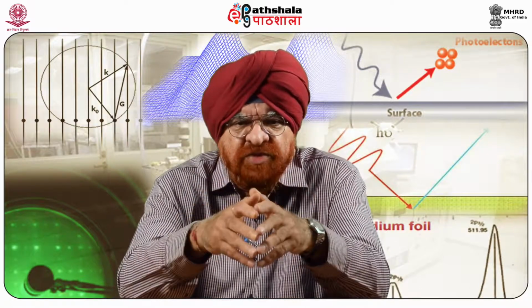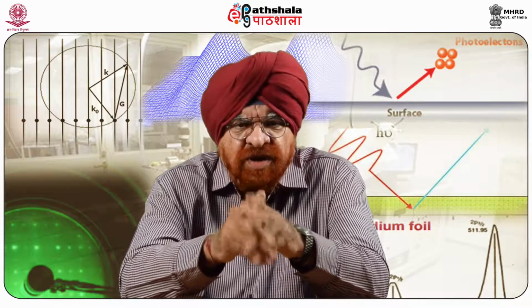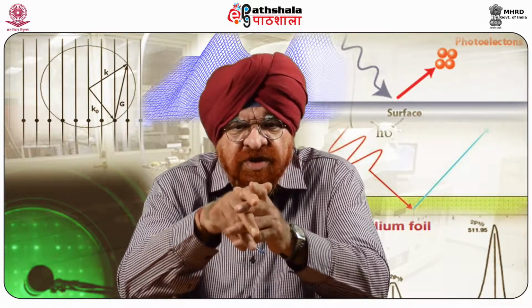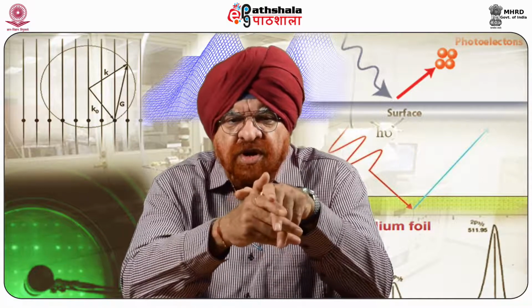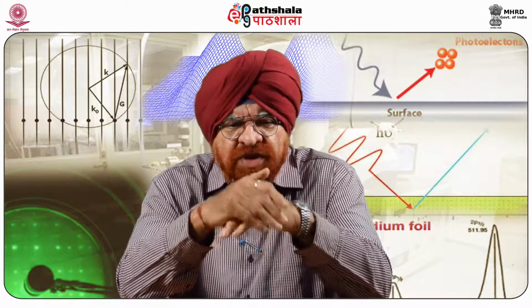The AFM can examine any rigid surface, either in air or with the specimen immersed in a liquid. Minor and major differences between smooth surfaces are shown dramatically and very clearly. On one hand, the AFM can resolve very tiny features, even single atoms can be seen.